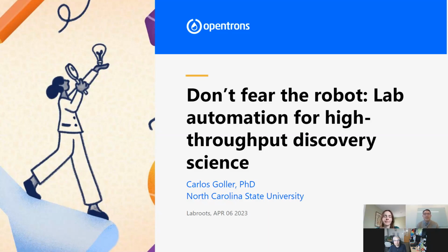Yeah, I probably have not much to add to what you all just said. I think it really ultimately depends on the user, right? Even if you have no programming background at all, you can operate the OT2 because there's so much resource available to you. But if you don't have any programming skill, I do highly recommend reaching out to OpenTrons or to a reagent vendor.